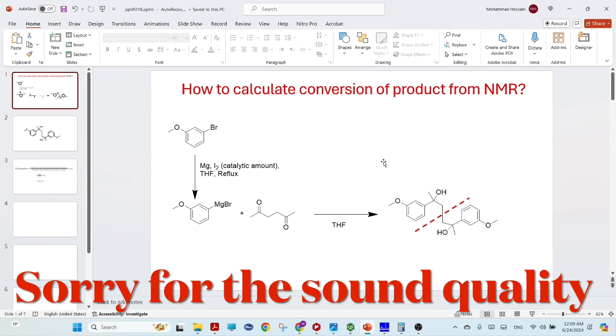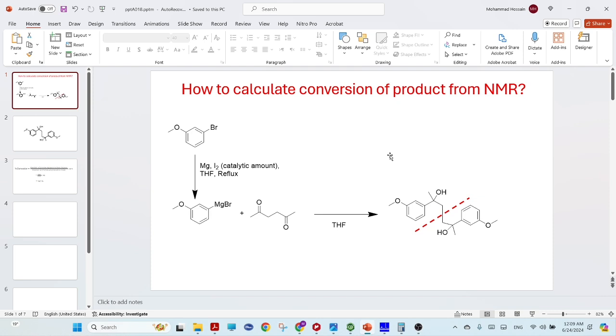After a long time, I'm making another video, and it is a very important video for the students who want to know how to determine the conversion of a product from a reaction by taking the NMR of the crude. So here, let's take an example.